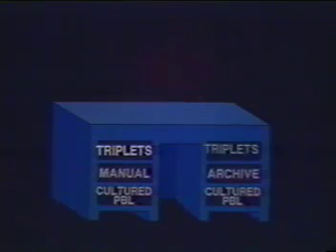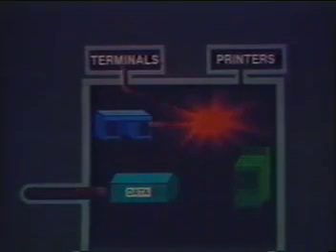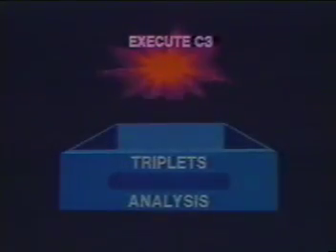This reformats the protocol information into a set of individual sample labels while simultaneously installing a new analysis drawer onto your desk. As FACSDesk collects data for a sample, the secretary transfers the information from the collection label onto an analysis card which it places into the new analysis drawer.